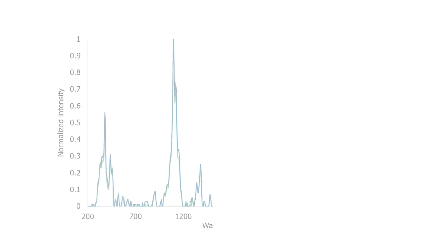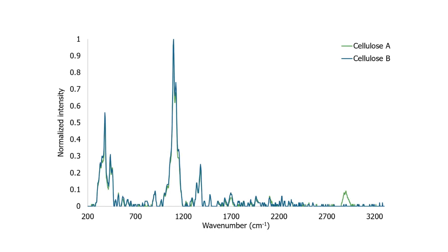Let's make this even more specific. We just found a cellulose particle, but cellulose can come from a variety of sources — not just paper towels, but kim wipes, clothing, and many other places. What's cool is that each of these has a unique Raman signature, so I can generate reference spectra for each material. Hound searches for unique peaks to distinguish similar materials. For example, one type of cellulose has a unique peak at 821 wavenumber, but another has a unique peak at 2909 wavenumber. Hound automatically distinguishes between these two types of cellulose by identifying these unique peaks. This feature makes my ID more specific to my process, so I can trace particles back to their source faster.